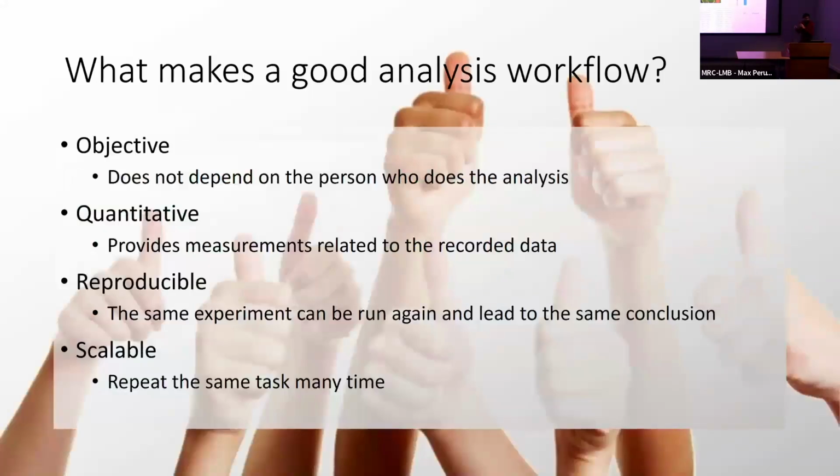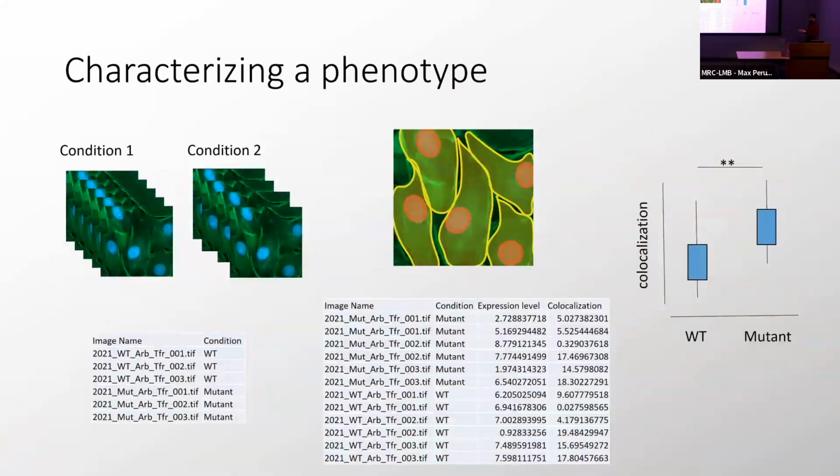So one reason I put this slide is that what we are doing is not trying to improve your images to make them look better. It's not Photoshop. It's not trying to make a nice picture for print. It's beyond that.